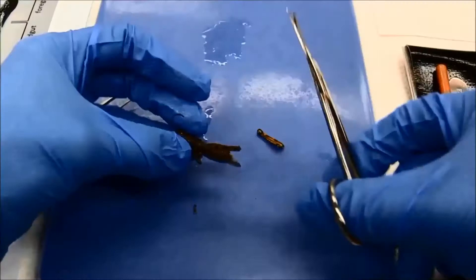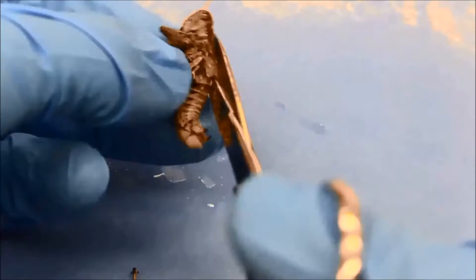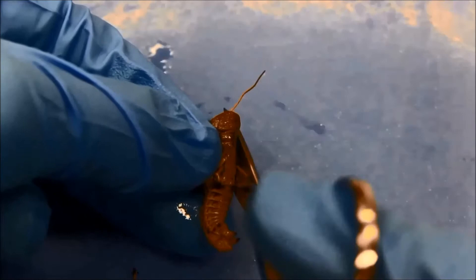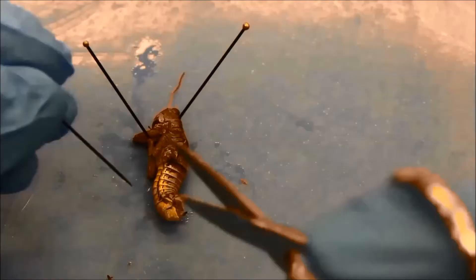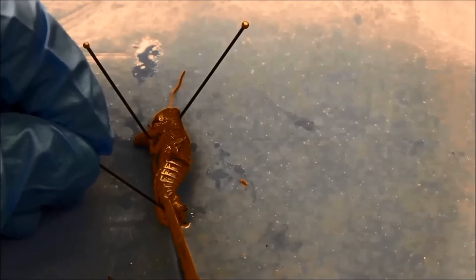Then using scissors, I carefully remove the hind legs and the wings. After this I put the grasshopper on its side and use insect pins to anchor it to the dissecting pad. Then I use scissors to cut the exoskeleton of the grasshopper along the side, starting with the last segment of the abdomen and moving slowly towards the head.